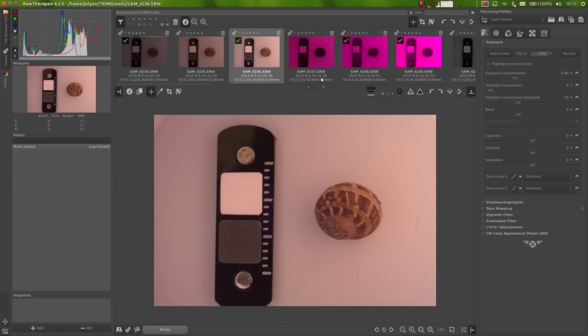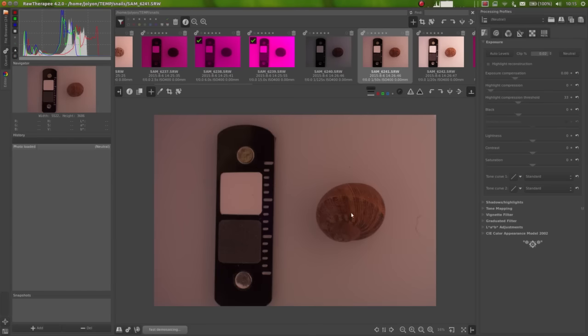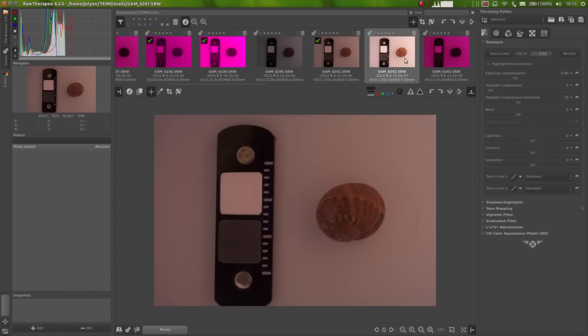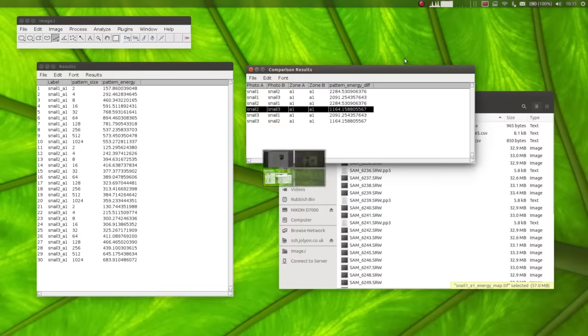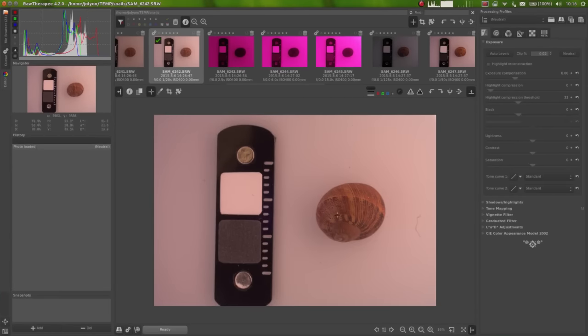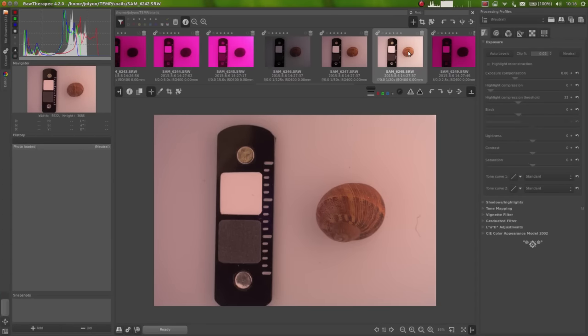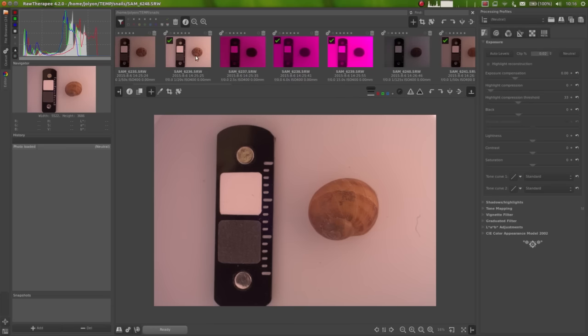Here is snail 1, and it's apparently very different to snail 2, which I think I'd agree with. But snail 2 is close to snail 3. So this is snail 2, and this is snail 3. So these two, they seem to have much lower pattern energy in general compared to snail 1, which has much more powerful markings.